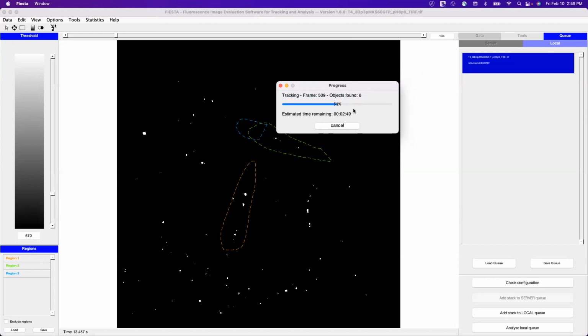Basically, as Zach said before, this is a binary image. This image tells the software to look at a bright spot as the start point, where you want to fit the Gaussian, and you can set the threshold up and down.